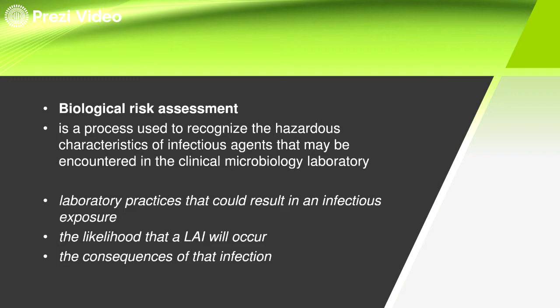So, ito yung tatlong importante na process under the Biorisk assessment. What are the lab practices that can result in the infectious exposure? What is the likelihood that a lab infection will occur? And what are the consequences of that infection? Okay? So, sabi dito, Biorisk assessment, this is a process used to recognize the hazardous characteristic of an infectious agent that may be encountered in the clinical microbiology laboratory.